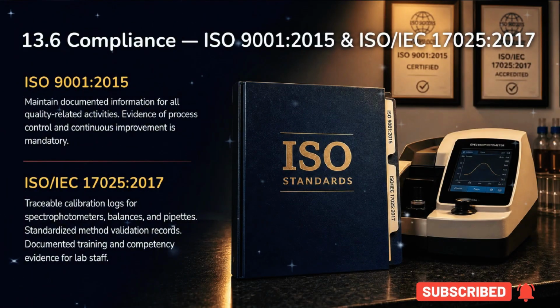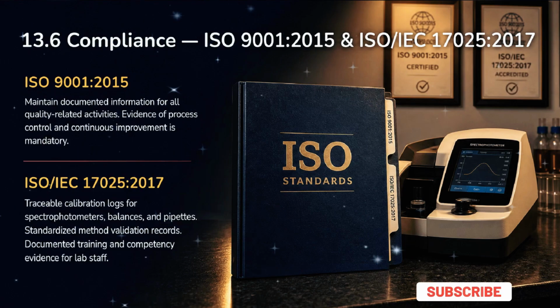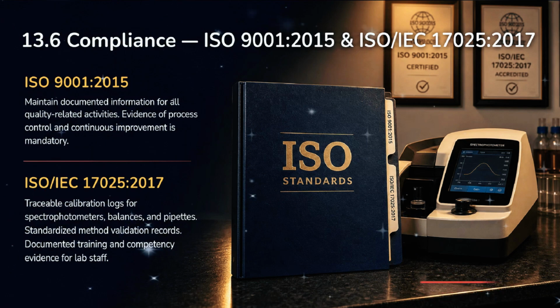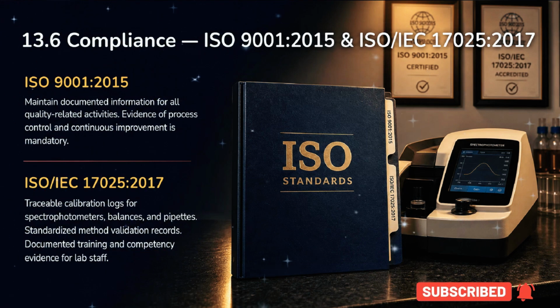Compliance with ISO 9001-2015 and ISO IEC 17025-2017 is essential. These standards mandate documented information for all quality-related activities, including traceable calibration logs for equipment, method validation records, and evidence of staff training and competency.